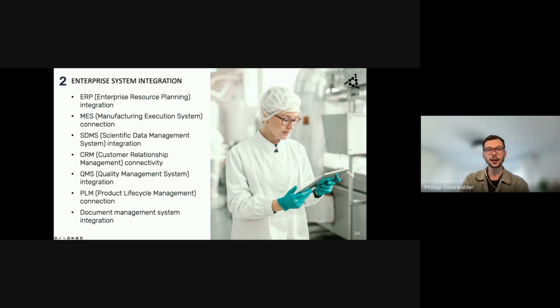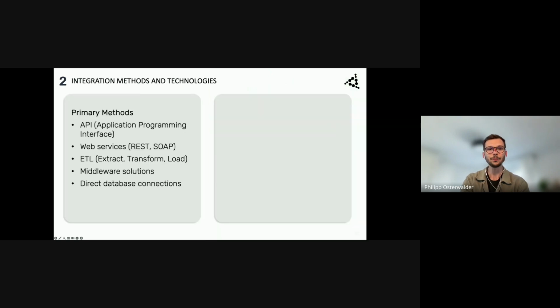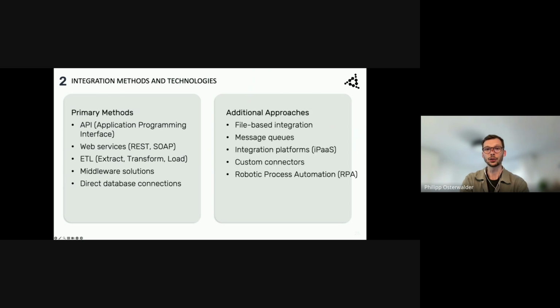Commonly, LIMS platforms integrate through APIs, web services, or ETL pipelines. You may also see middleware solutions or direct database connections. The right approach depends on your lab's complexity. If your environment is modern and flexible, an API-driven integration might be the easiest. For older systems, you might need specialized adapters or a phased integration plan.